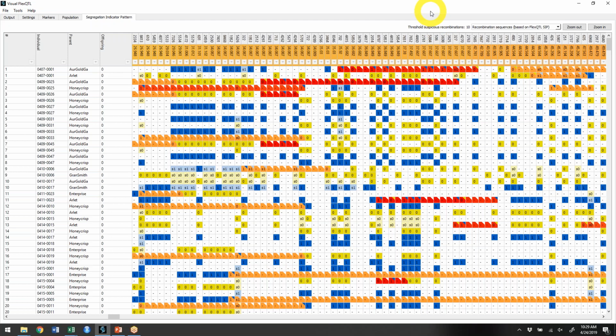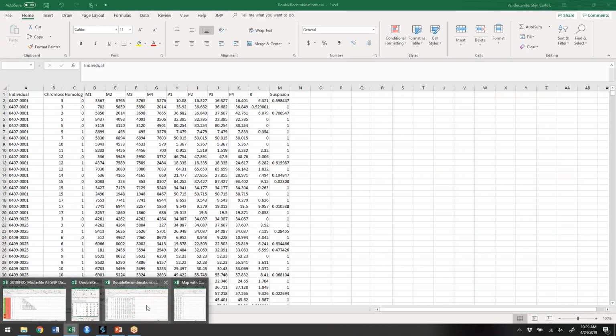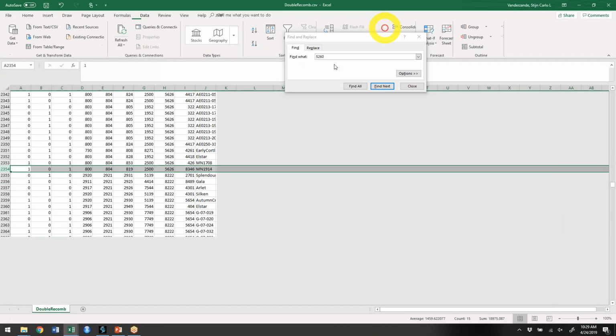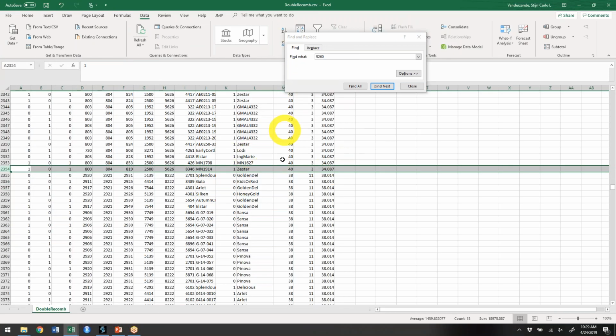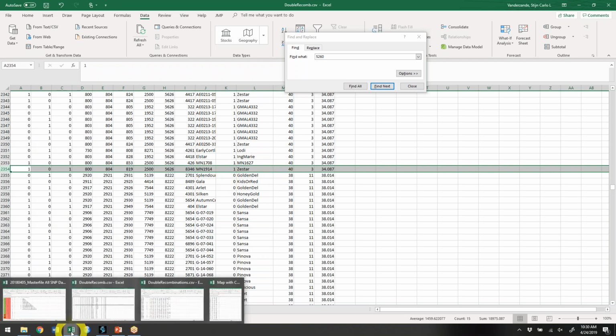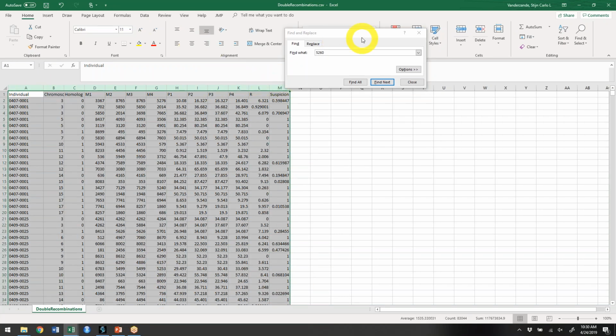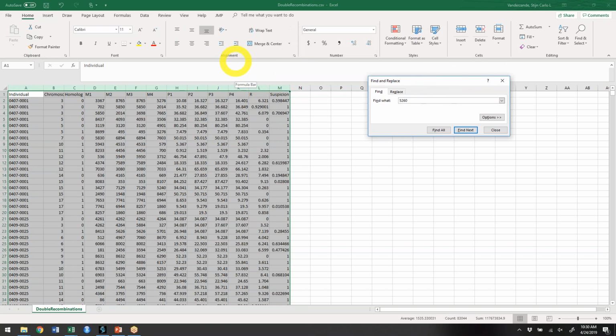So once you've solved the big ones, the ones that occur a lot, you might want to move towards areas where there are double recombinations that involve multiple markers. For that, we would need this file. There, I would also suggest sorting, but given that there are multiple markers involved, it's a bit trickier which marker to sort on.